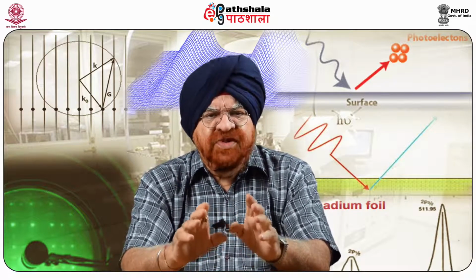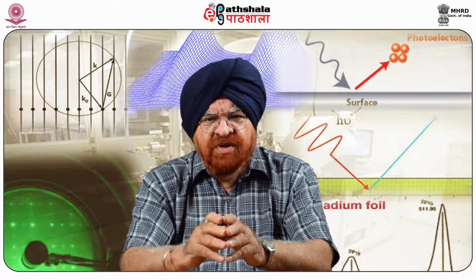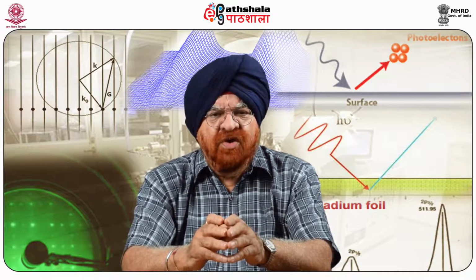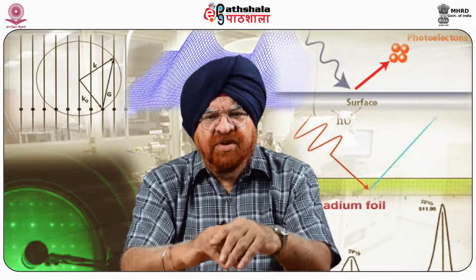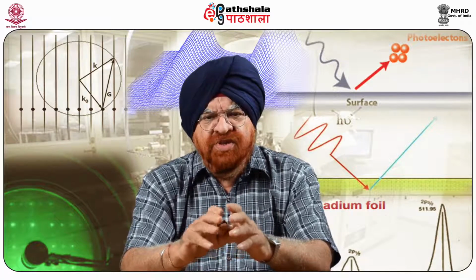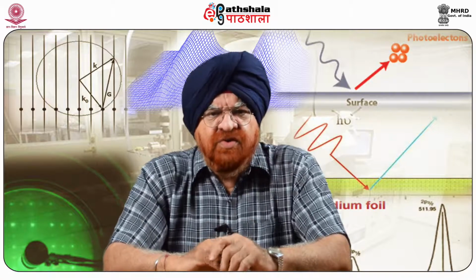The potential of the AFM, which does not require a conductive sample, is shown with molecular resolution images of a conducting or non-conducting organic monolayer and an amino acid crystal that reveals individual methyl groups on the ends of amino acids, which otherwise is very difficult to do.